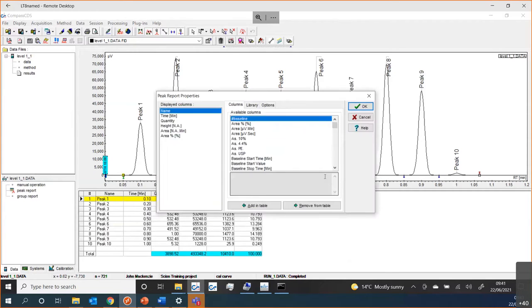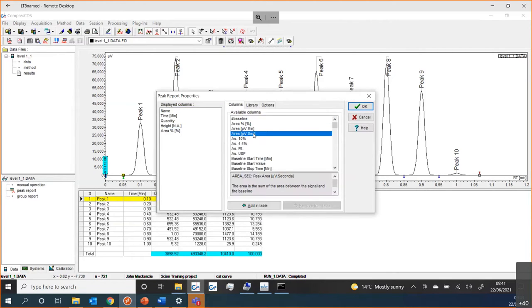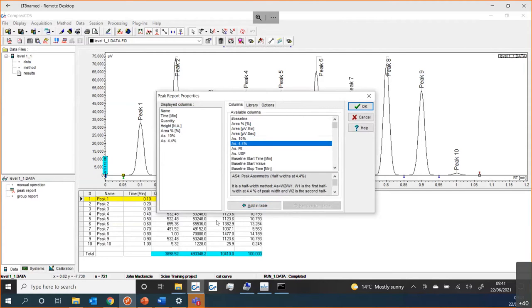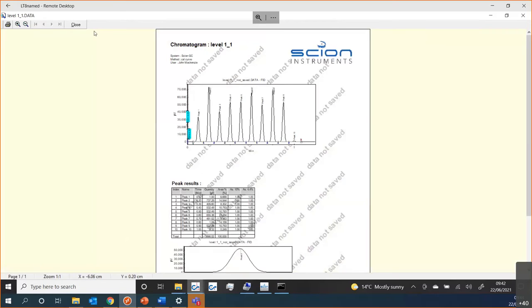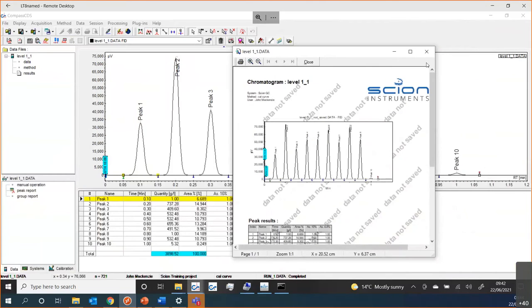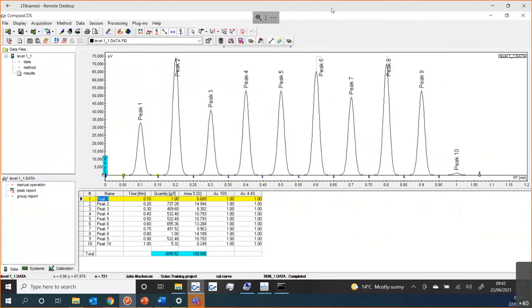So I probably did want to change those. I'll make some modifications — remove that one, add the asymmetry. I've made these changes and they instantly appear on my peak report. What I see here is basically what I will see in my printed report, so I can have a quick look at that just by pressing that button. You can see the writing is quite big. I see we've still got some people waiting in the lobby so I can't quite get to the button on my screen — my apologies, bear with me while we let a few more participants in.